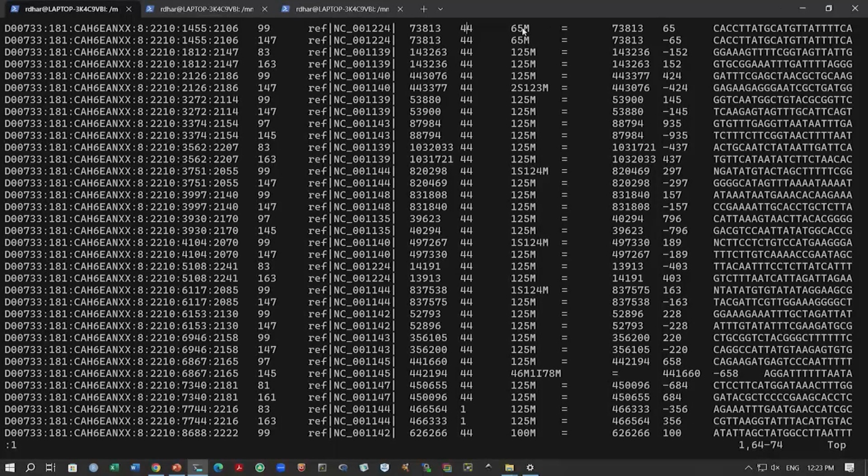Okay. This could be match or mismatch, again we do not count that here, we cannot get that information here. Okay. So, 65M, that is good because we have the full alignment for this read that we have, right. So, this information tells us okay, the full read has been aligned against the reference sequence. 125M means we have 125 bases in the read sequence that have aligned against the reference sequence, and there is no insertion or deletion. Okay. And these are ideal scenarios, right. So, if you have very good quality data, most of these will be M's, right, you will not see anything else most of the time.